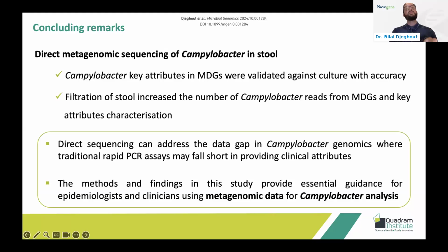But importantly, our study shows that direct sequencing addresses the gap in Campylobacter genomics, particularly where traditional PCR assays may fall short in providing crucial clinical insight. This method and the findings from this study serve as essential guidance for both epidemiologists and clinicians, facilitating the effective use of metagenomic data in Campylobacter genome analysis.